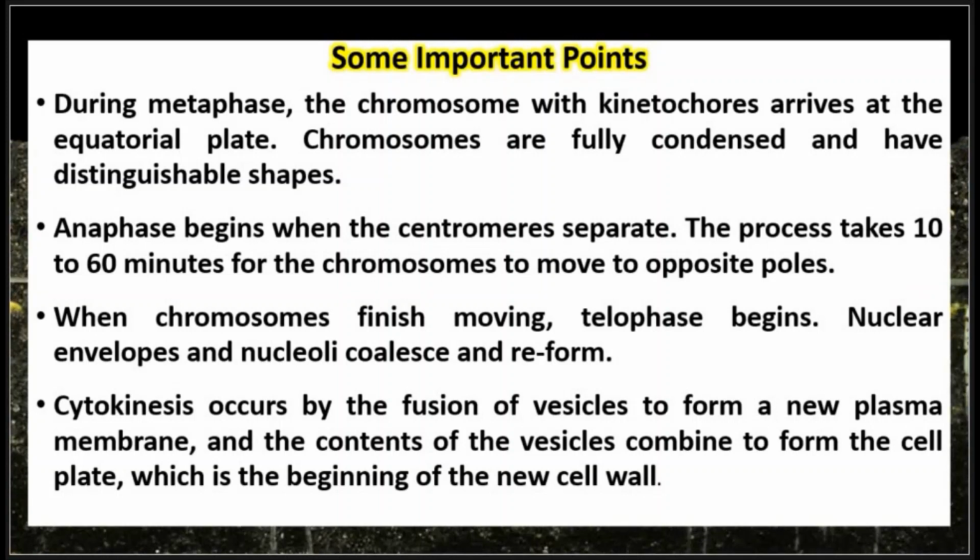During metaphase, the chromosomes with kinetochore arrive at the equatorial plate. So metaphase is very important in mitosis. Anaphase begins when the centromeres separate and chromosomes start moving from the metaphase to opposite poles. When chromosomes complete the movement, then telophase begins.